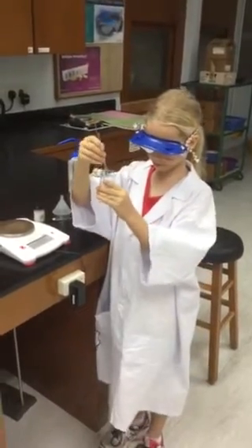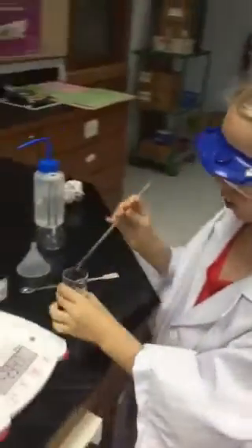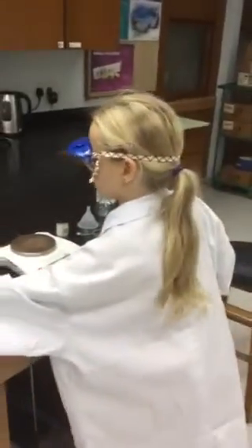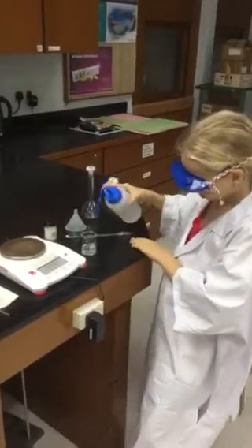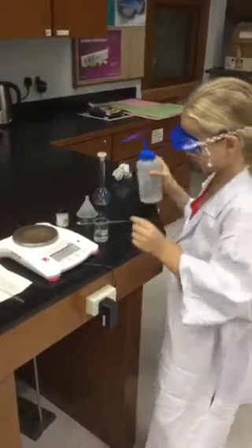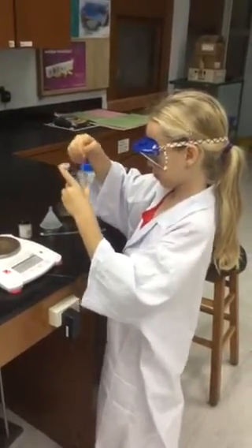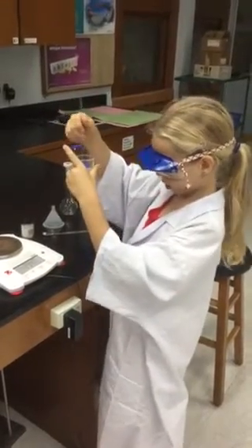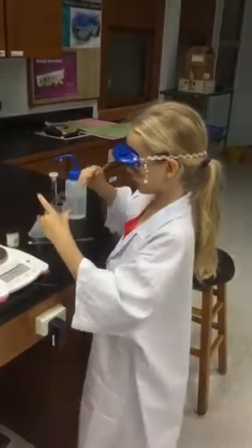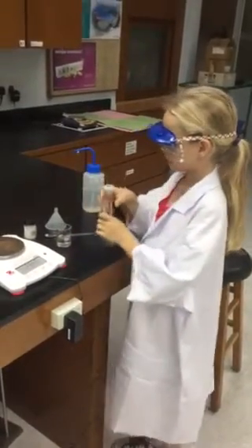Okay. And with a glass stirring rod, we're going to dissolve as much of that as possible. Now, Nina, can we add a little bit more water, please? We must make sure we do not add anything like 100 cc's, which is going to be impossible as we're in a 50cc beaker. Is it all dissolved, Nina? Yes. Okay, once it's all dissolved, please transfer your solution to the volumetric flask.